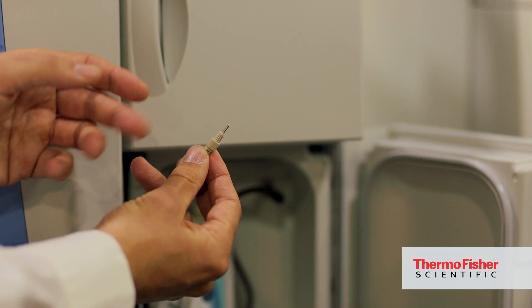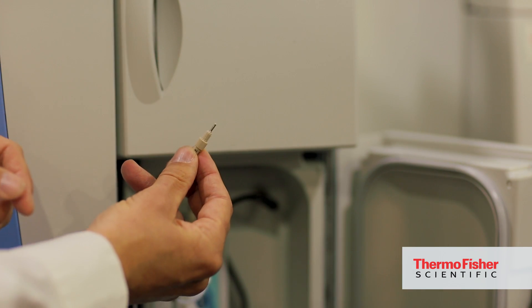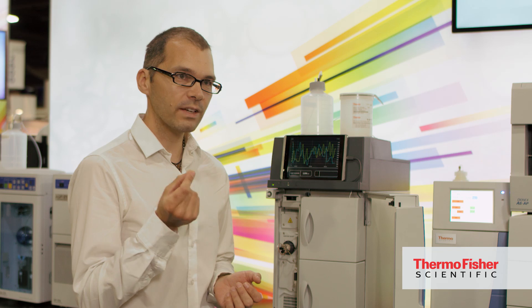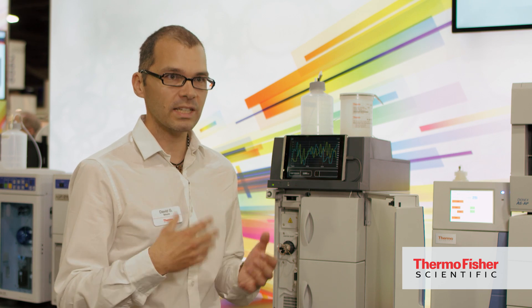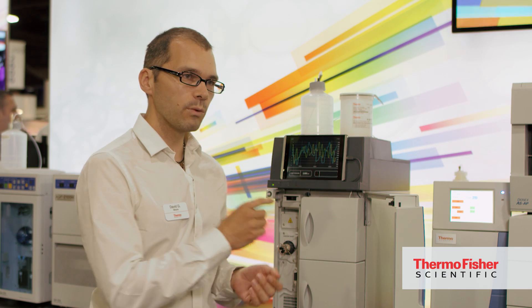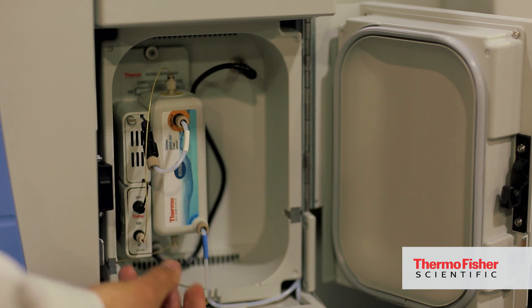That technology is Viper fittings. These really allow any customer, whether they're experienced or a novice, to make perfect fittings every time without the need for tools and without the need for specialised training. It's very important to get a good seal of your tubing against the port, and what the Viper fittings do is make that accessible with just a finger-tight connection.